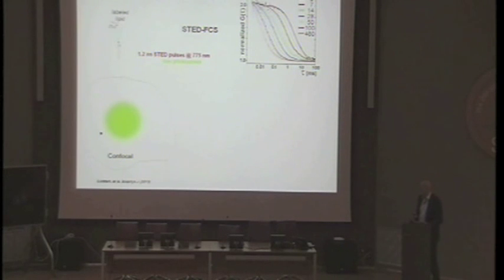Now what happens if the molecules get very quick? Then you're not able to take movies anymore because they become quick, and there may be just a few of them. Is the method useless? The answer is no. Because then you can do something that biophysicists call correlation spectroscopy, fluorescence correlation spectroscopy. You check out the molecular diffusion, you quantify it, and then you know how quickly a molecule diffuses.